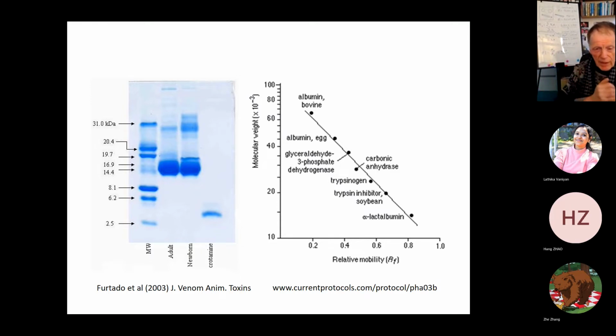They have a uniform negative charge across the DNA molecule. There's no need to bind any sort of negative charge like SDS to the DNA, and we also use different types of stain. We tend to use things like ethidium bromide.